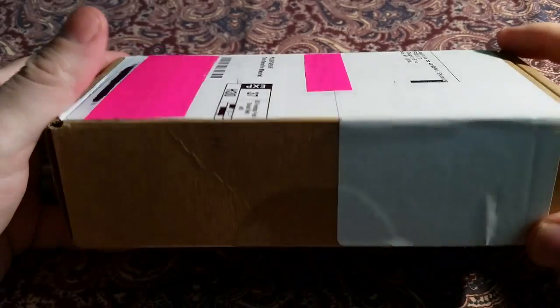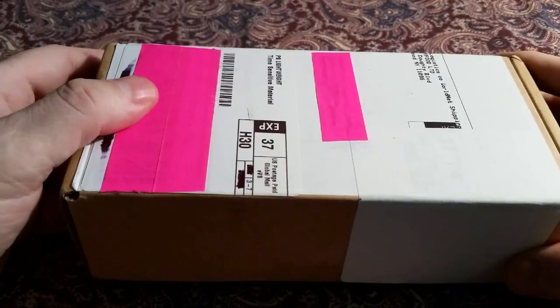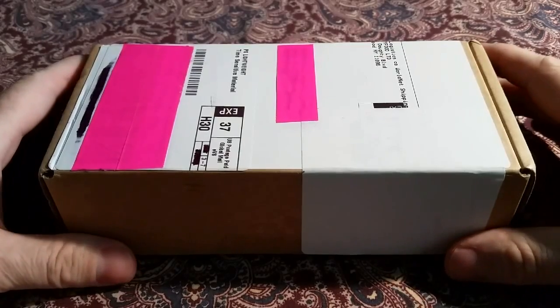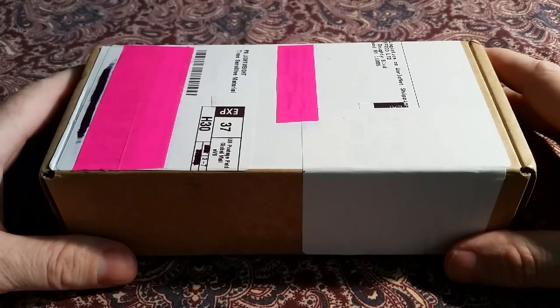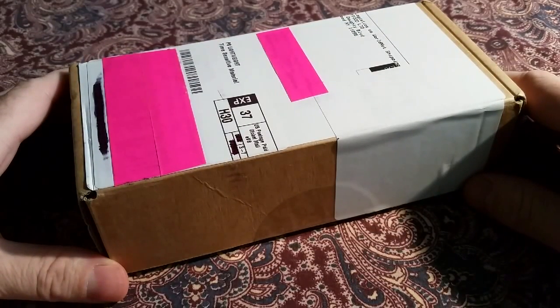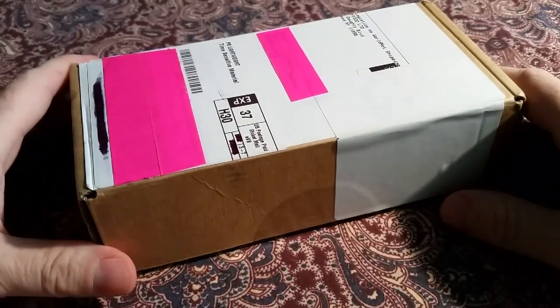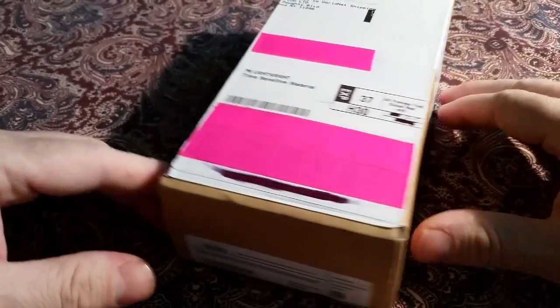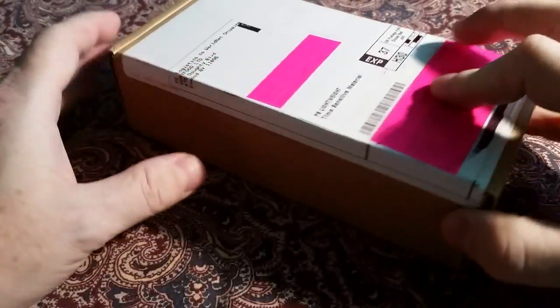I thought I would do an unboxing on this since there are no unboxing videos for it, and a lot of people think this thing doesn't really exist. Well, it does exist. It was a successful Kickstarter campaign that raised over $2 million fairly quickly. There were almost 13,000 backers, the campaign was successfully funded in June 2014, and it's been a long time since they were able to develop and ship it out. So here it is.